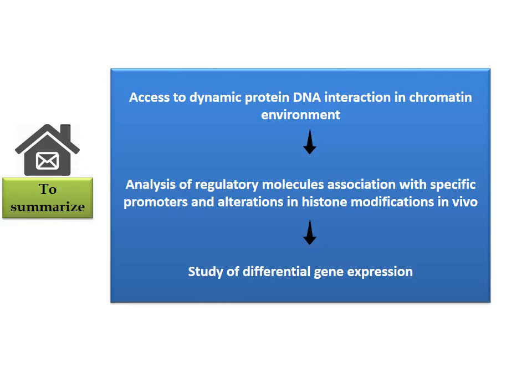So conclusively, what we can say is chromatin immunoprecipitation assay can have access to dynamic protein-DNA interactions occurring in vivo in the chromatin environment, and it can be used for analysis of regulatory molecules binding to specific promoters and alterations in histone modifications, which will be helpful for studying the differential gene expressions in various conditions.